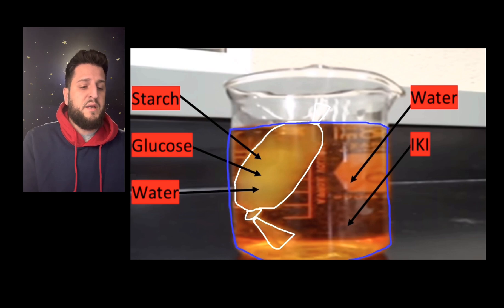On the outside, within the beaker, outside of the dialysis tubing, we have the liquid portion. So you have water and the Lugol solution, which is also known as IKI.